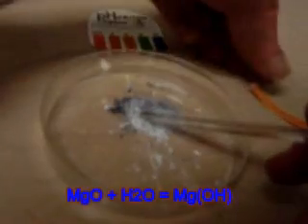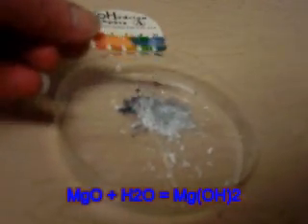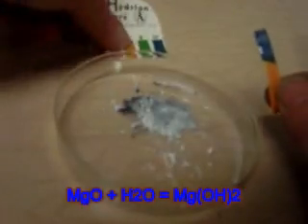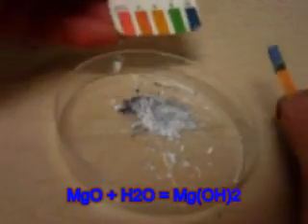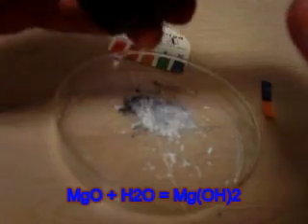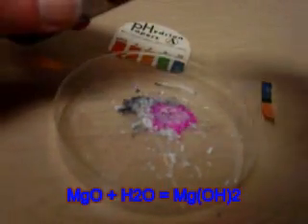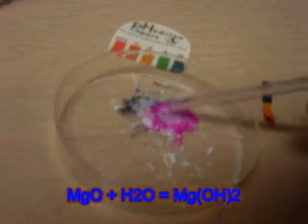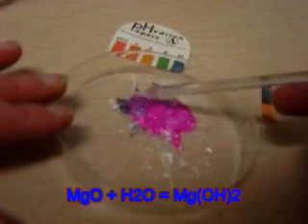Well, we've got those two tests. We can test our litmus paper, and right away we see that our litmus paper is a nice blue — an indicator of hydroxide. And also our phenolphthalein — one drop of phenolphthalein and we get our nice fuchsia color, which is very typical of our hydroxide OH group.